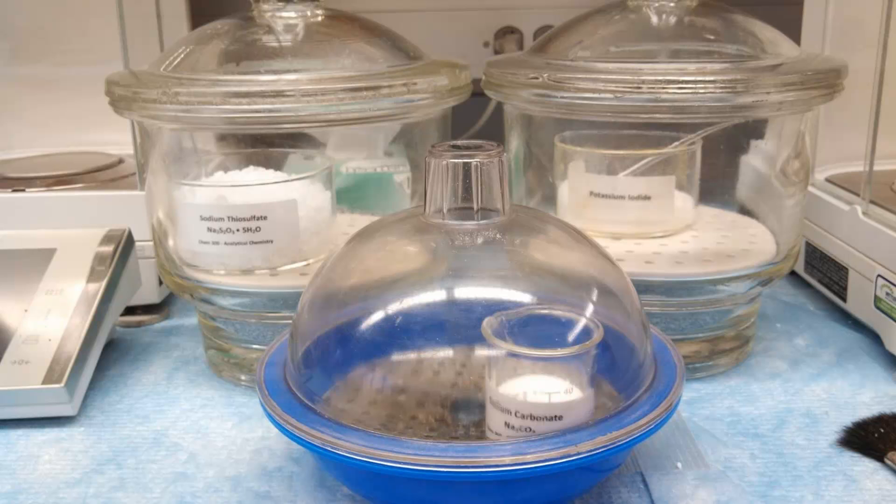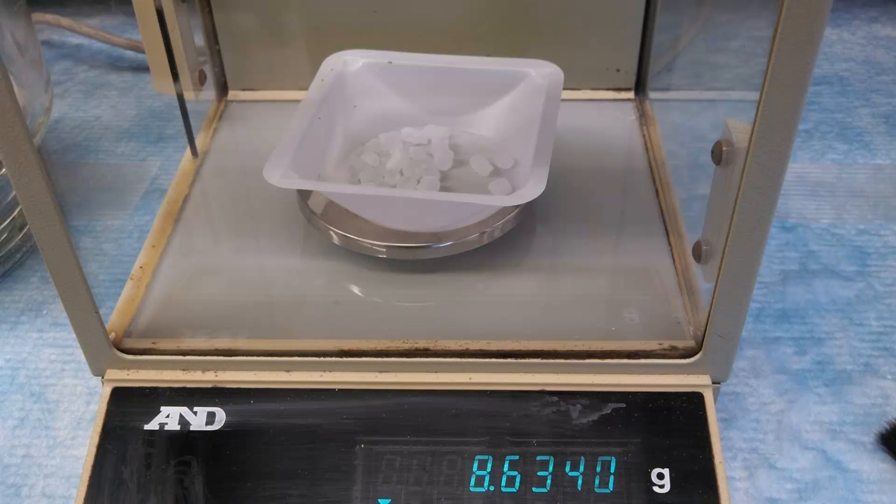For the sodium thiosulfate, your procedure says to weigh it directly into an amber glass bottle, but you're not going to do that. You're going to use a weigh boat, one of the big weigh boats, and these will be on the counter, and weigh out your approximately 8.7 grams. You'll notice that the sodium thiosulfate is in big chunks, and so if you can't get exactly 8.7, don't worry about it. Get as close as you can. You're going to standardize the titrant, so it doesn't necessarily matter.